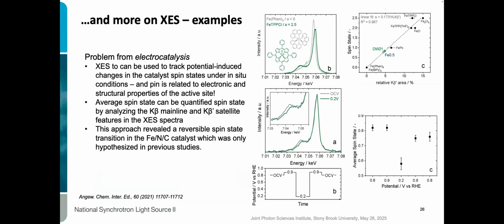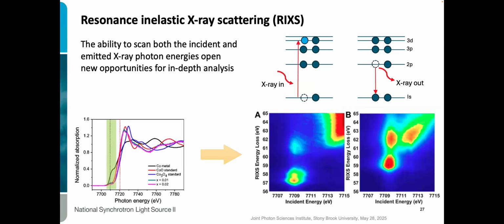More examples. You see a difference in spin, and this difference in spin translates into the structure. This is an electrochemical reaction, which employs a molecule that looks like this. Again, it changes where it's located within the ring as the potential changes, and makes it an active catalyst. Two slides about fancier measurements.